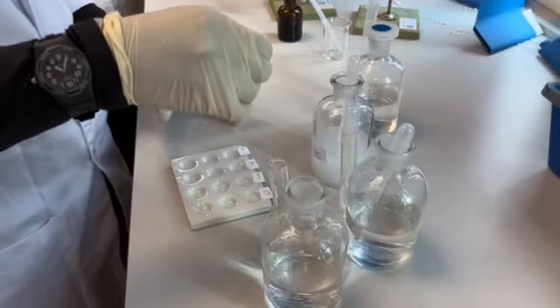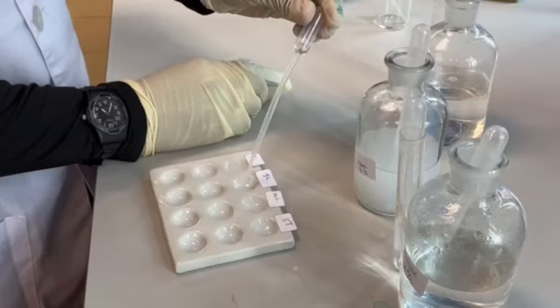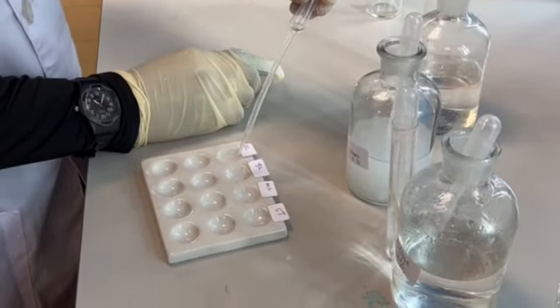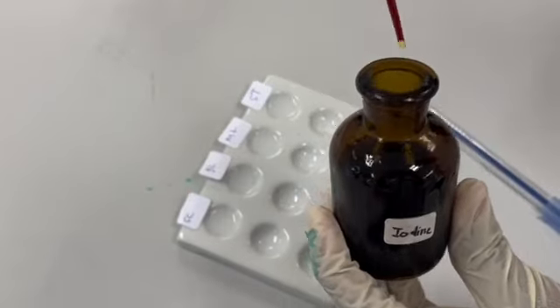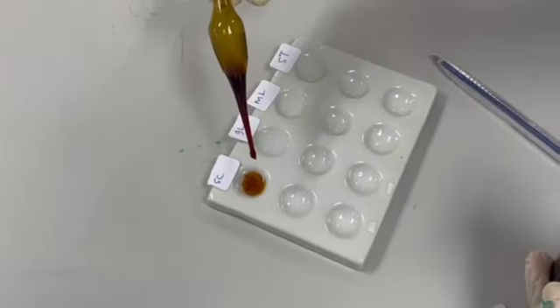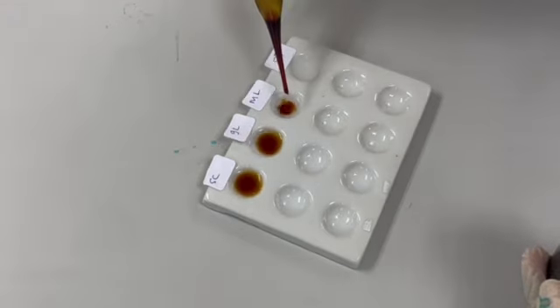Place 5 drops each of sucrose 2%, glucose 2%, maltose 2%, and starch 5% onto tile patches. Add 1 to 2 drops of iodine potassium iodide solution and observe.